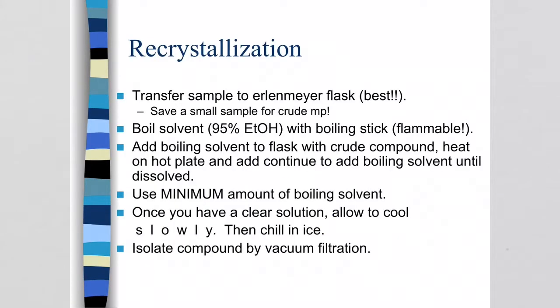Okay, so when you're doing recrystallization, one of the things you want to do is transfer the compound that you've isolated by vacuum filtration to an Erlenmeyer flask, not a beaker. Do not do recrystallizations in beakers.